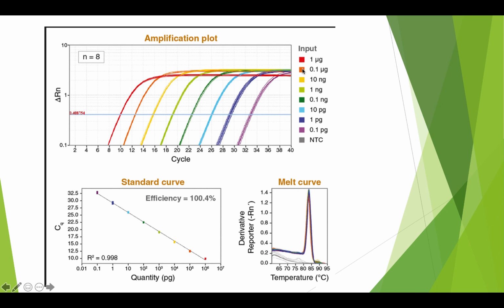The lower the concentration of the template, the lower you start from. For example, if you have 1 template of DNA, 1 becomes 2, 2 becomes 4, 4 becomes 8, 8 becomes 16, and 16 becomes 32. So each time it requires a cycle. You might not get above threshold level ever, or maybe at cycle 32, and you need to give it more cycles to reach it. If you have 100 copies of template, you start from 100, second cycle 200, third cycle 400, fourth cycle 800, then 1600. So you have a lot more.